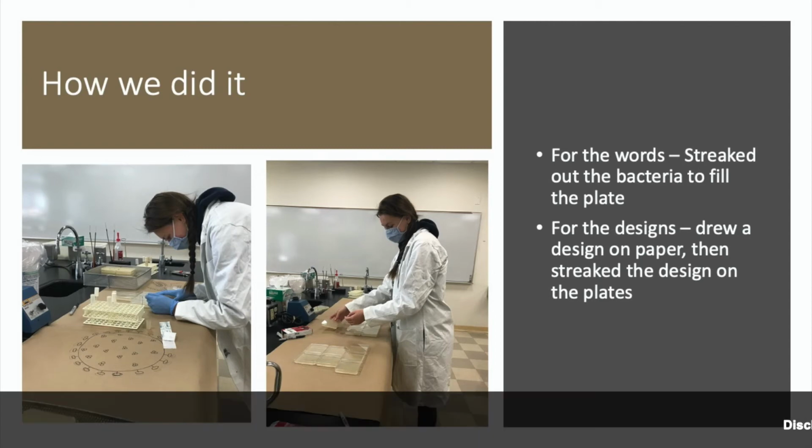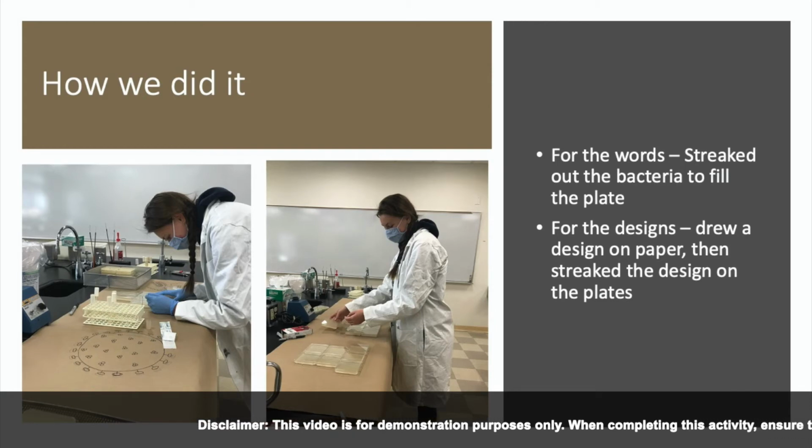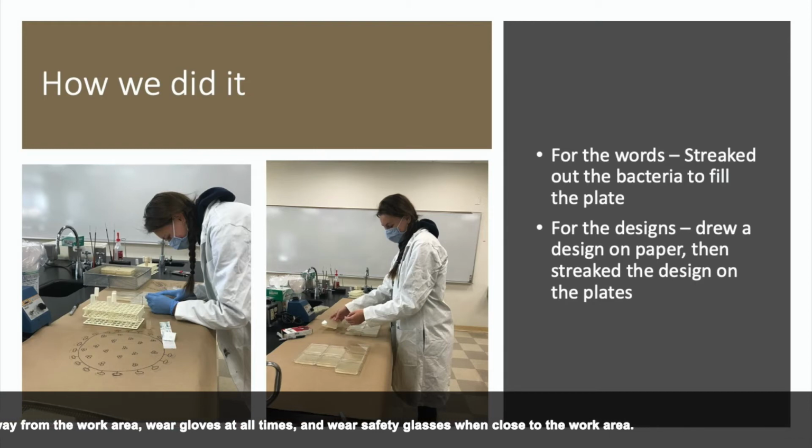To make our agar art, which you'll see in a little bit, we first had to make the paint, or the solution, to streak onto the plates with our swabs. To do that, we took some culture medium and put it in some vials, then picked up parts of the colonies of Photobacterium from the plates and mixed them into the culture medium vials.